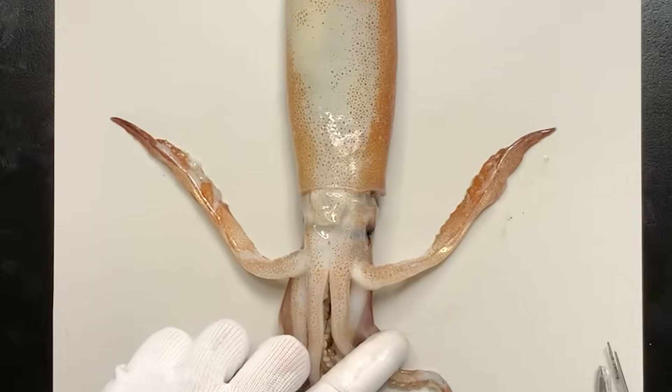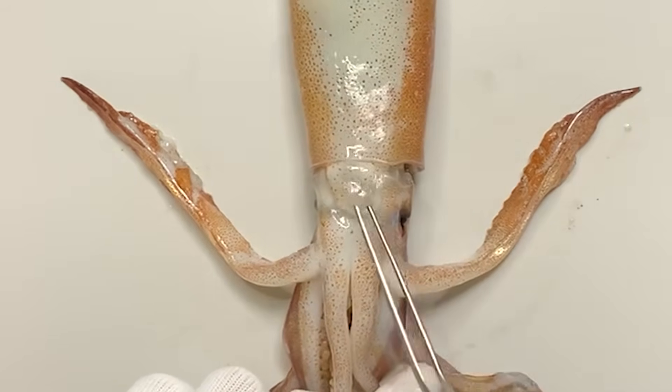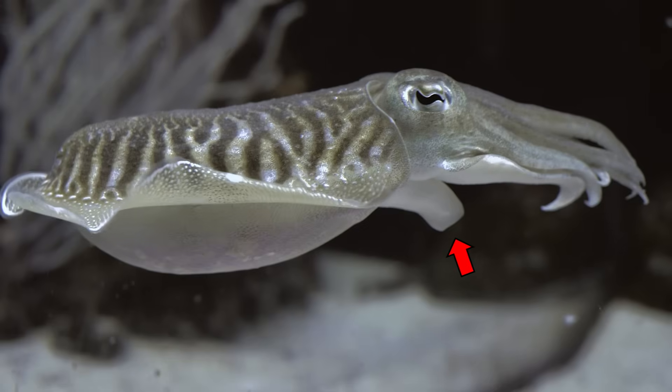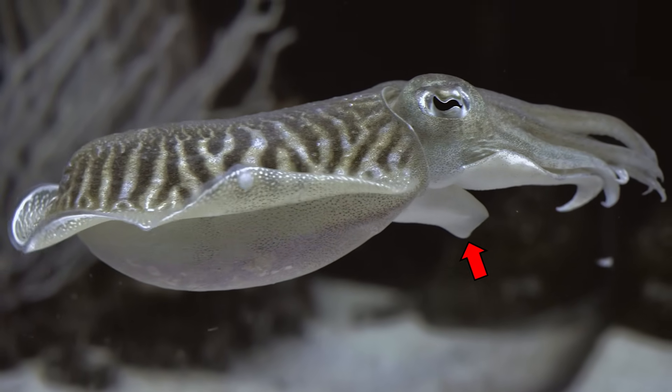Between the body and head, there's a mouth-like opening — but it's not a mouth. It's a funnel. Water is sucked in and shot out through this funnel, allowing the squid to swim. That's how they move: slowly using fins, or quickly by shooting water out of the funnel.